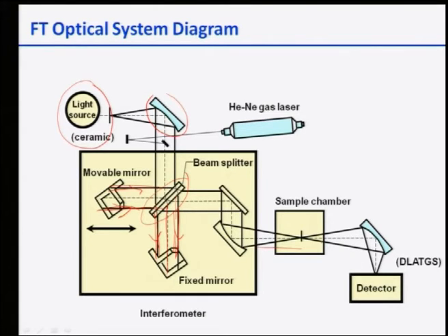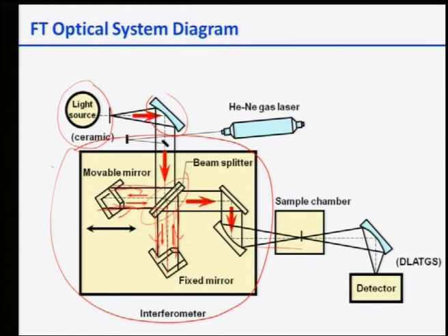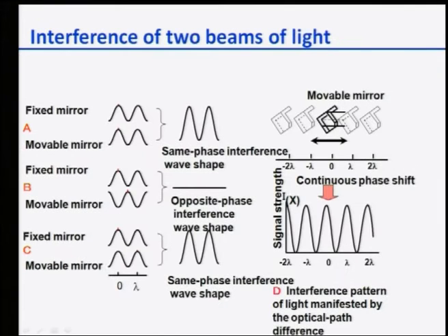Finally, this patterned beam falls on a sample, and then whatever is coming from the sample is collimated on a detector. So that is basically the heart of the machine. This is what is shown here in arrows, it goes back.